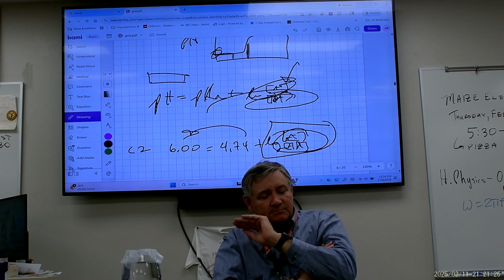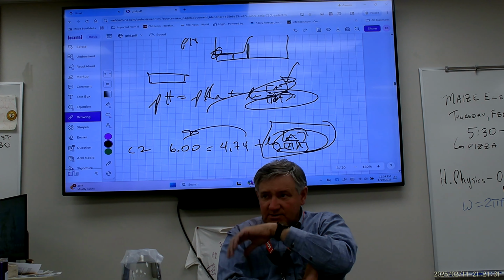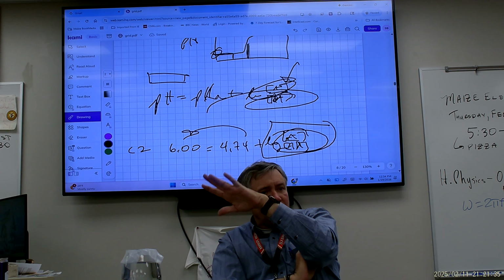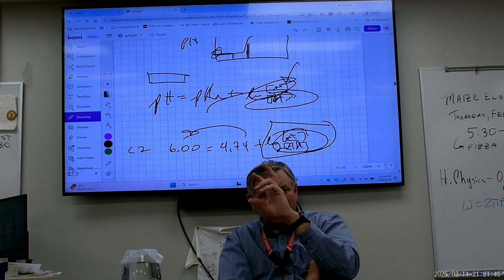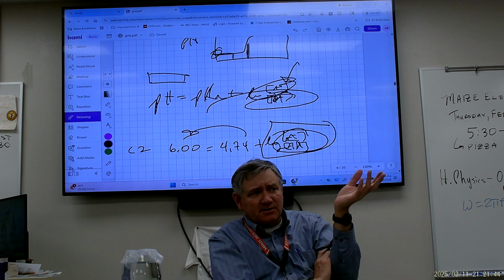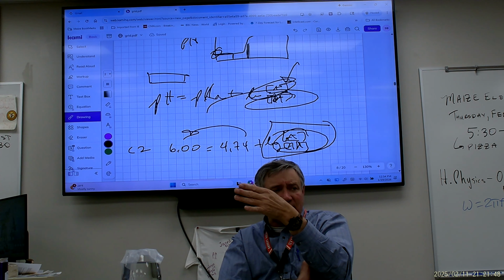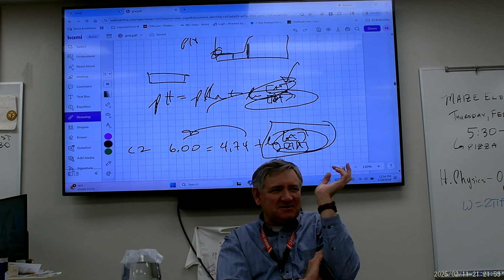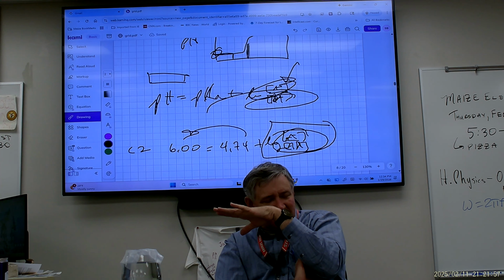So here's what you're going to do. You're going to take that 0.0373 grams, add that to the acetic acid, titrate it with sodium hydroxide, boom, there you go. You don't have to get as picky at that equivalence point because you're not going to find the Ka value off of it. So just kind of get close, okay? Still back it down. I'm not saying add 10 milliliters at a time and go, okay, hey, we got it. We added 10 and 20 and then we measured the pH. No, okay? At least go in 2 milliliter increments.